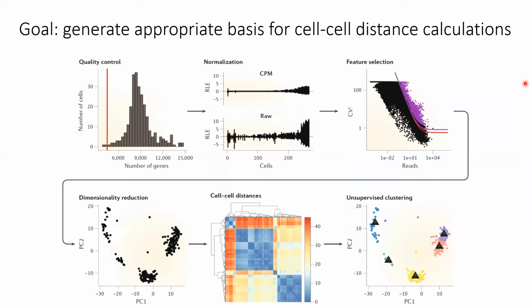And as you can see, this whole process involves a lot of compressing and twisting and turning the raw data. And how well this process allows us to separate cells based on physiological differences in biology is still not well understood. So at this point, I'd consider this standard process more of an art than a science. So when you apply this to real data, the accuracy of the process is not guaranteed, and we should be critical when we interpret the results. And I think it's really important and helpful to understand how each analysis step can affect your experimental results.